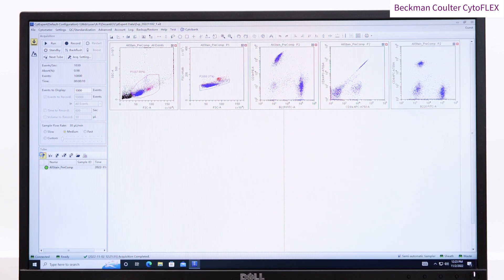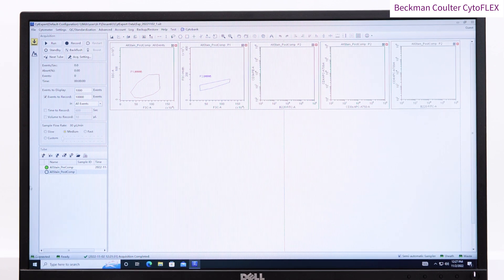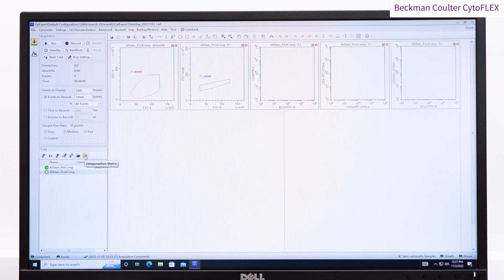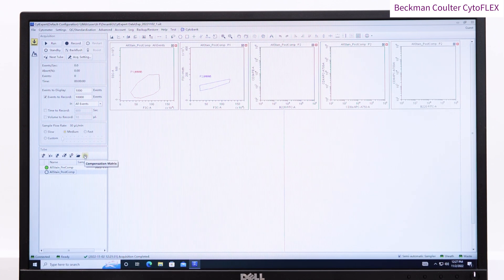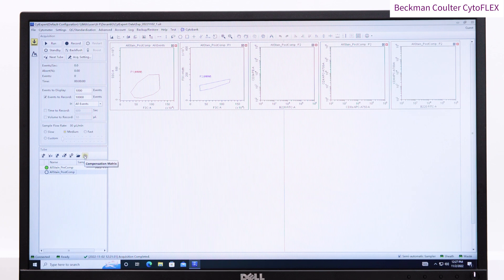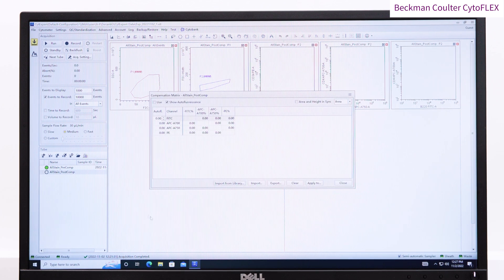Here, I'm going to create a new tube, and with that tube selected, we can go into the compensation matrix, into the library, and choose the compensation that we just created.